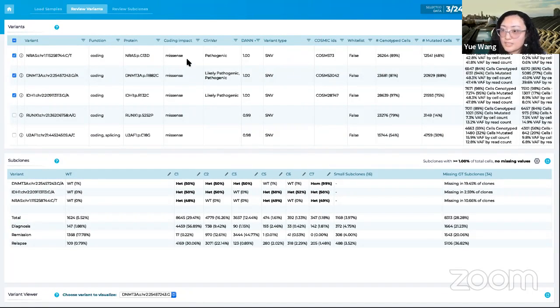So for the raw data, as I mentioned, you already get it from the Tapestri Pipeline, which includes your loom file and some others, for example BAM and VCF. Those can all be used for you to perform any different analysis if you have, for example, some other R package available.